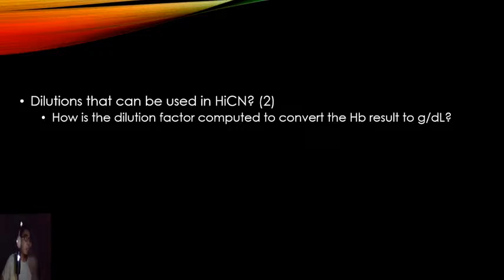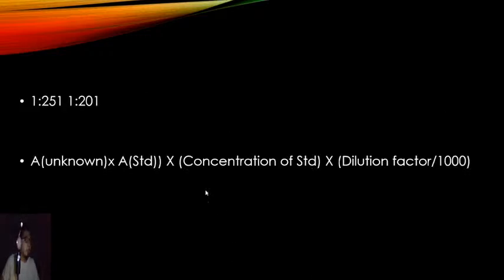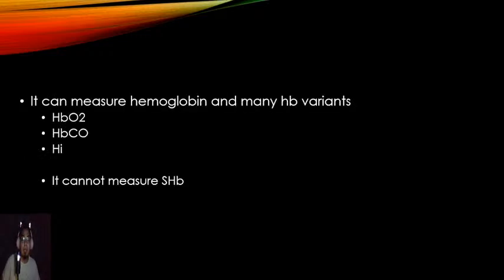All right. So dilutions can be used. So here: absorbance of the unknown, absorbance of the standard, concentration of the standard, and dilution factor, all divided by 1,000. Don't forget the 1,000.